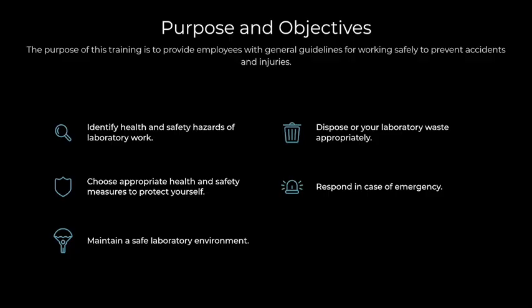Disposing of laboratory waste. Proper disposal of laboratory waste is essential to maintain a safe laboratory environment. Responding in case of emergency. In case of an emergency, it is important to know the location of emergency equipment and exits.